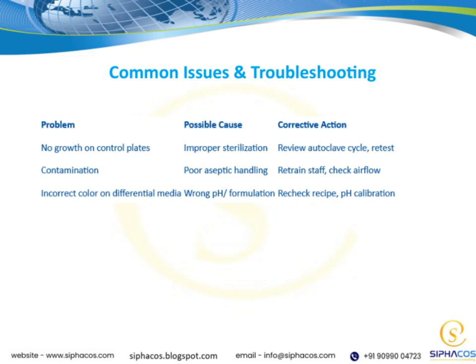Sometimes, issues stem from simple things like loose connections or incorrect settings, so double-check those basics first. If that doesn't resolve the problem, consult the troubleshooting guide or logs. These often contain valuable clues. Remember, troubleshooting is often a process of elimination, testing one potential fix at a time. Also, don't hesitate to seek support from colleagues or technical resources if needed. Connecting these troubleshooting steps to our overall goal of maintaining system reliability is key. By resolving issues quickly and accurately, we keep everything running smoothly and avoid larger disruptions down the line.